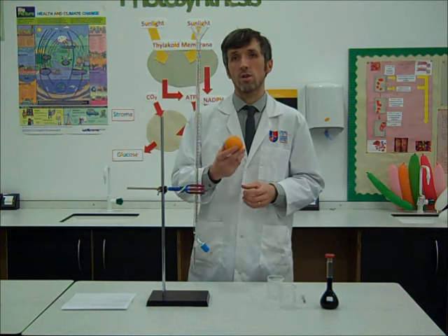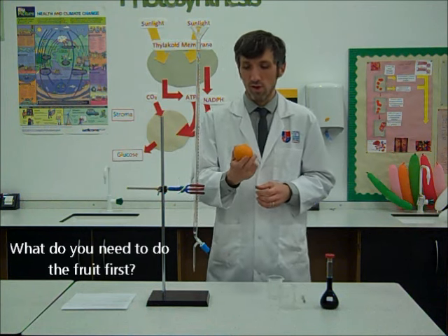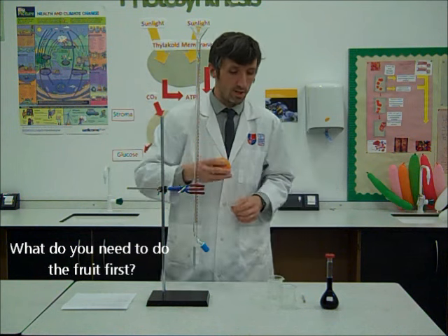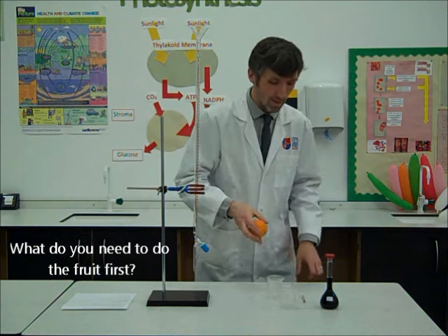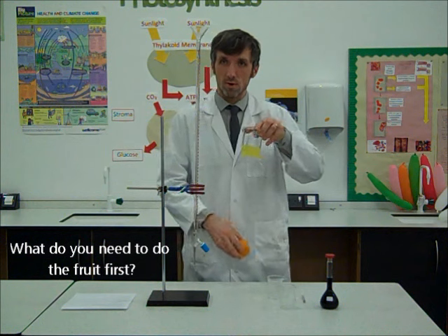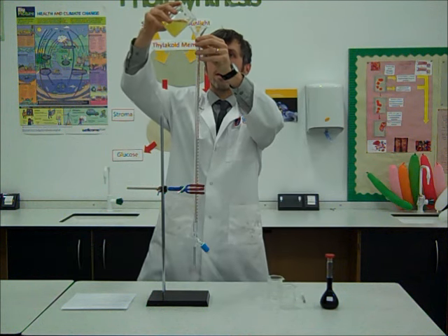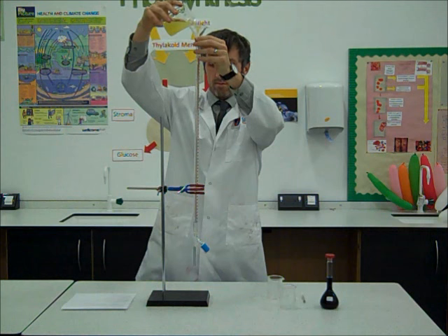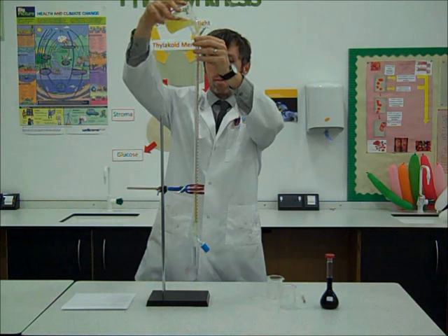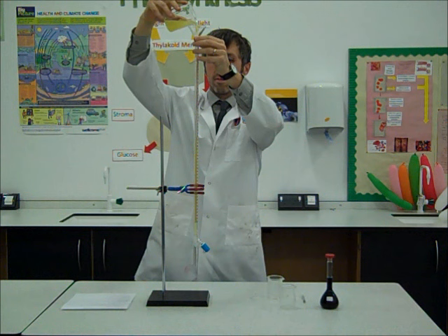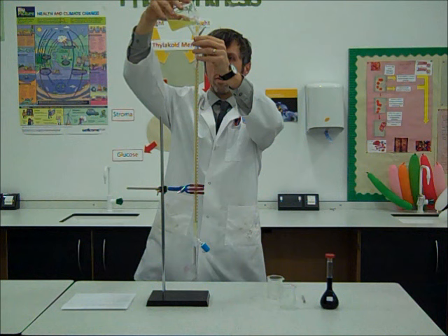To do that, we need to extract the juice of the orange first of all, and then put it into the burette. In Blue Peter fashion, here's one we've done earlier. We're going to put the juice into the burette and fill it right up. Just make sure that the meniscus is on the line.